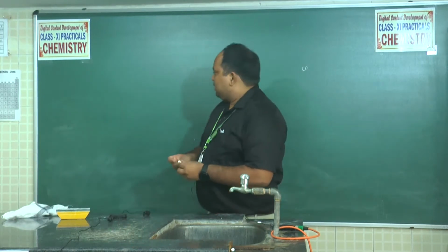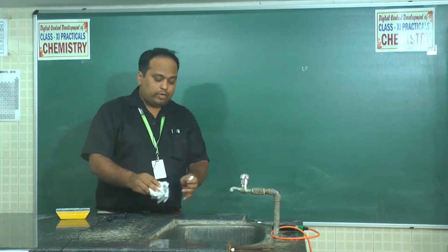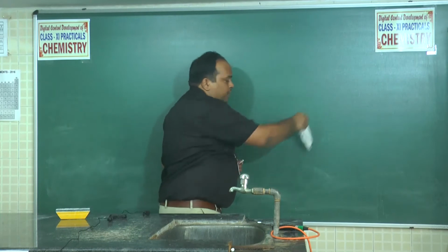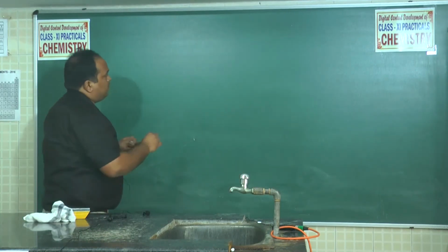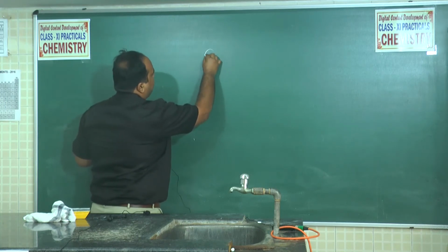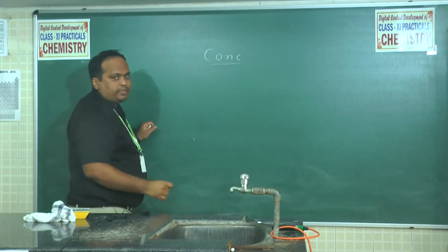Okay, students. So next we have to go for your titration. Before going to that, we have to know some theory about titration and some basic concepts related to titration. Clear? Before that, you have to know what is concentration and how to measure the concentration.